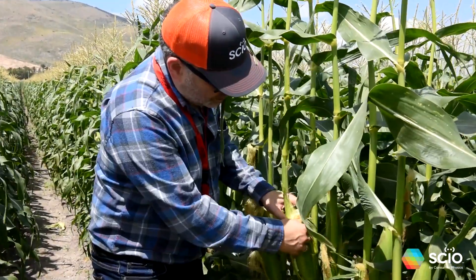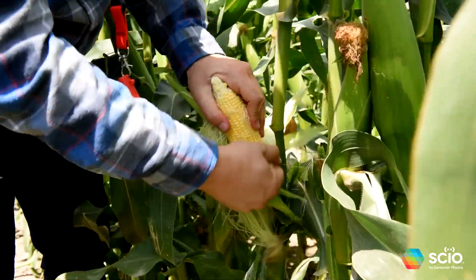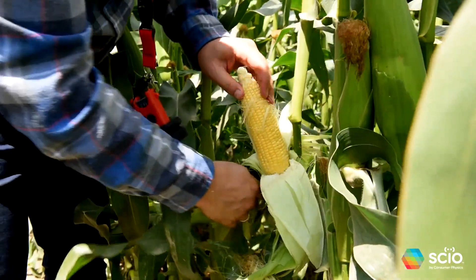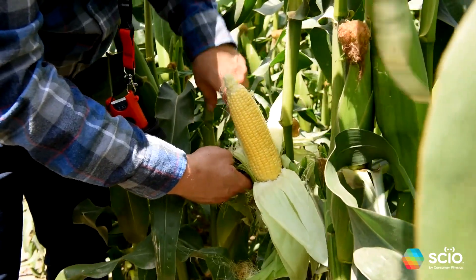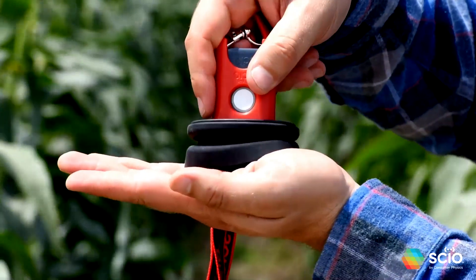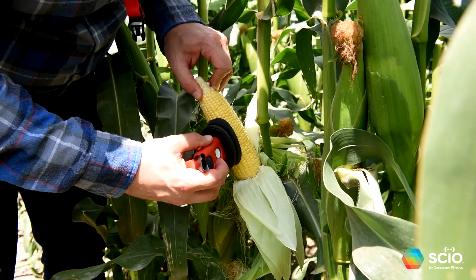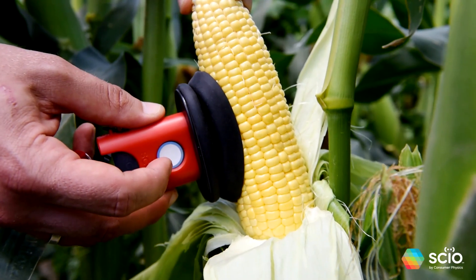Peel the husk and silk, and make sure there is none left on the cob. This adapter has a soft outer rim and a hard inner rim. When scanning, make sure the hard rim makes contact with the surface of the corn cob. Place SIO in the middle of the cob, parallel to the cob, and press to make contact.